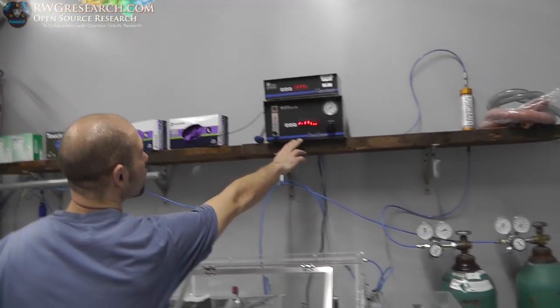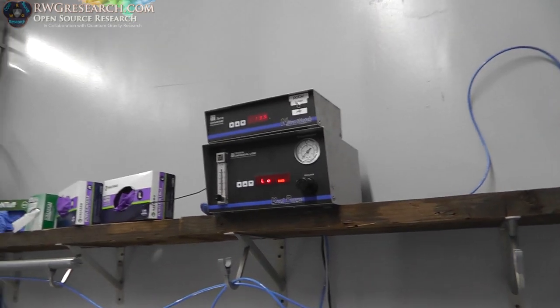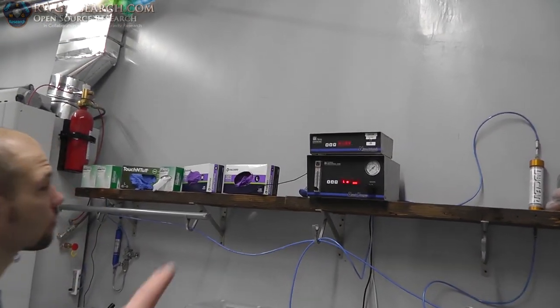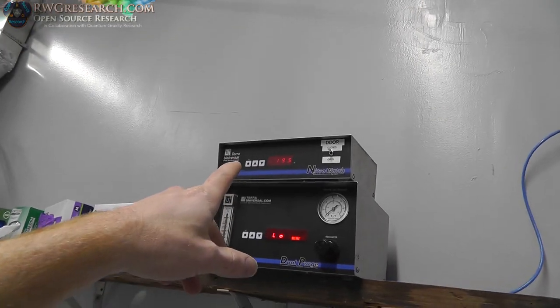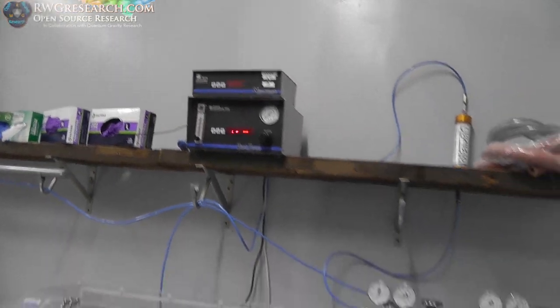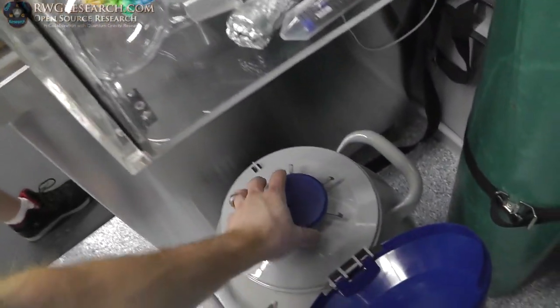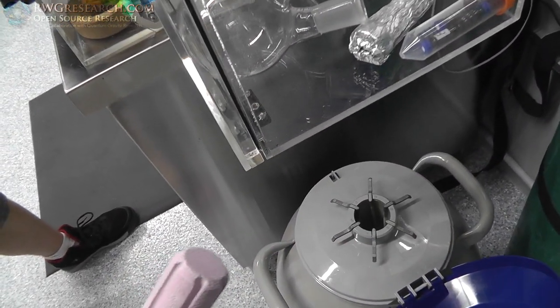Are these your pumps? No, this is for the glove box. It's a purging system for the glove box. It checks the RH value, which is at 19.5 right now. Okay. Yeah, that's very cool. Gases and liquid nitrogen. Gotta love the liquid nitrogen. Nice.